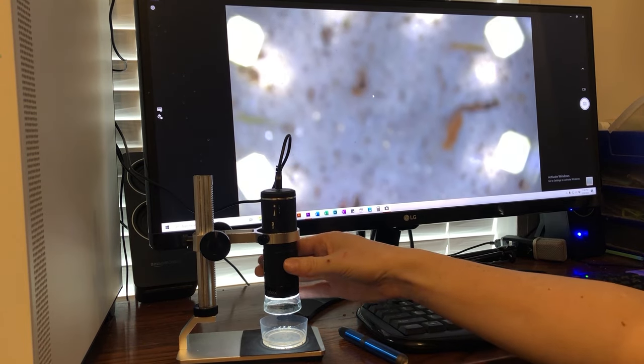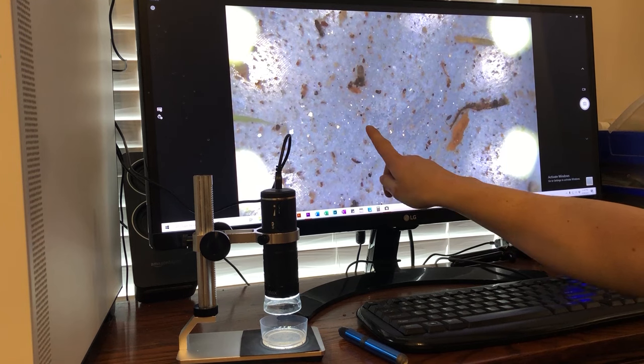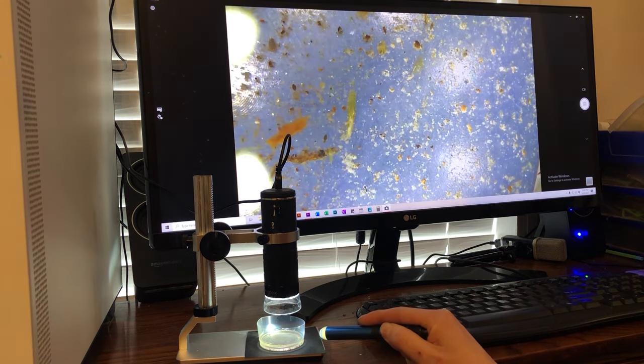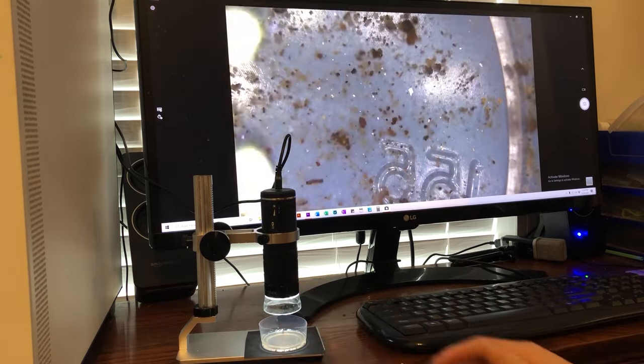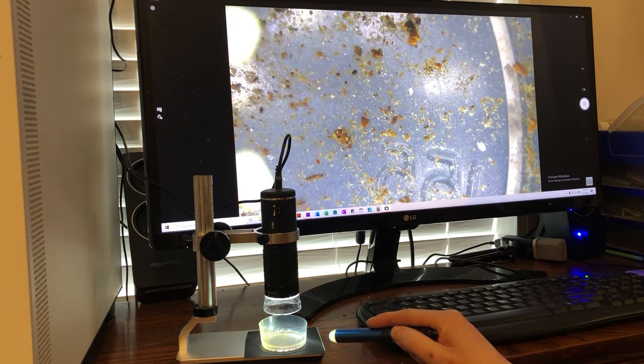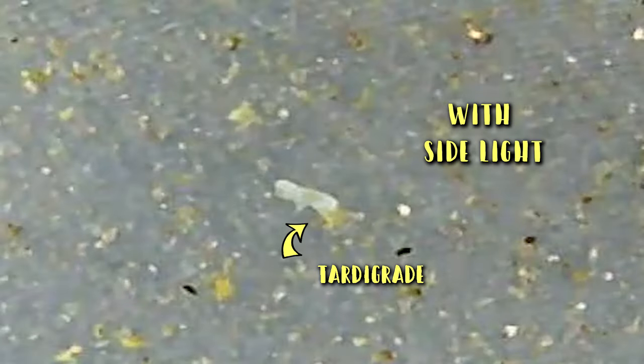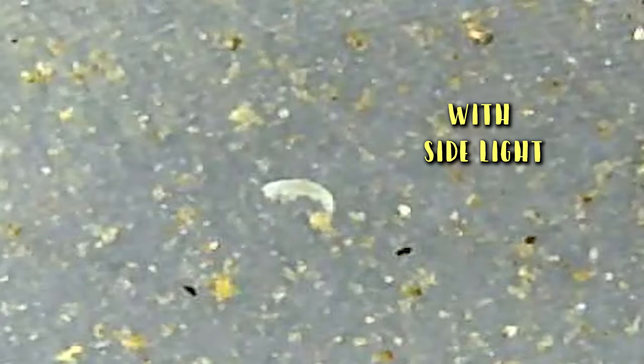Get your specimen on there and get it in focus. I already found something! Go ahead and grab your light and start rolling it across your specimen bowl, looking for anything that glows really bright. Once you clear an area, rotate your bowl and patrol a second area. Once we started this dark field view, it didn't take very long — we found a tardigrade. Best day of my life! There he was, so cute, and he really glows in that light. Here's a comparison: without the side light there's a tardigrade you cannot see at all, and then when you shine the light over it — boom, there he is. I'm pretty sure I found a bunch of tardigrades over the last few weeks and just didn't know it because they were completely transparent.